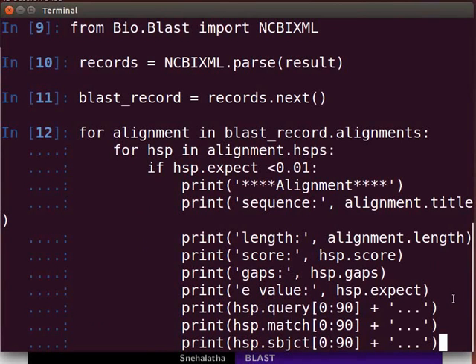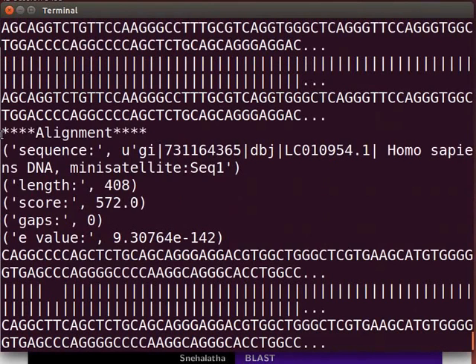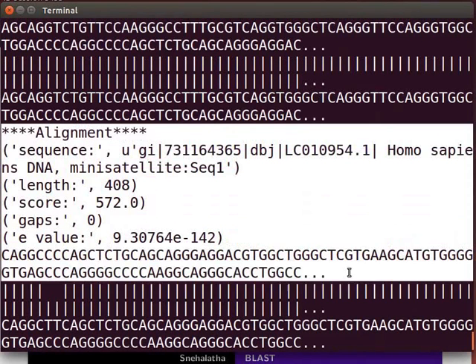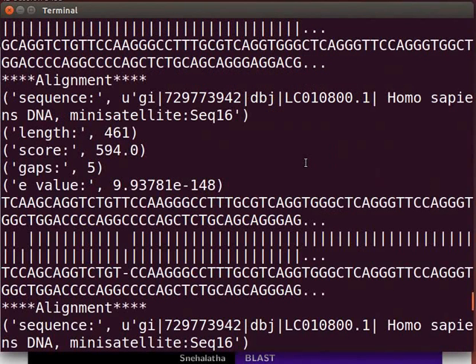Press Enter twice to get the output and observe the results. For each alignment, we have length, score, gaps, e-value, and strings. You can extract the required information using other functions available in the bio.blast package.